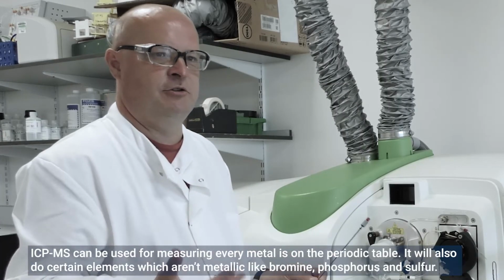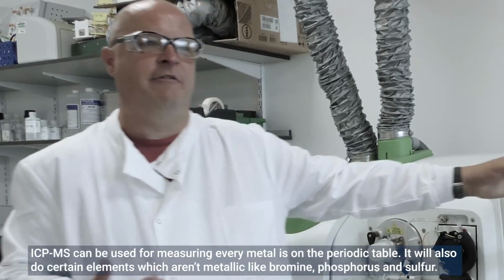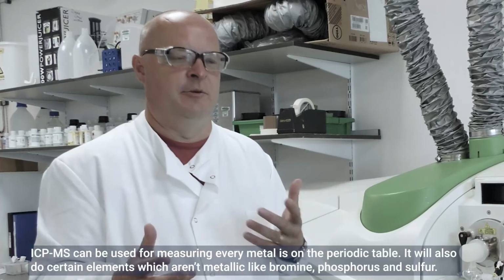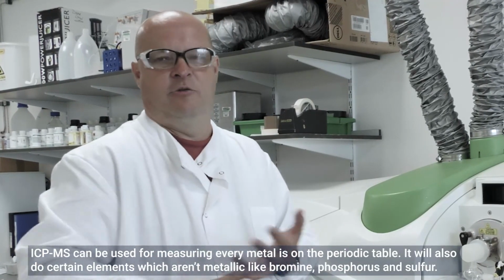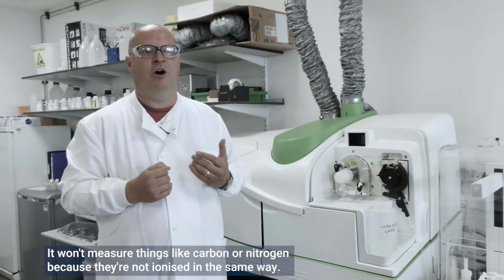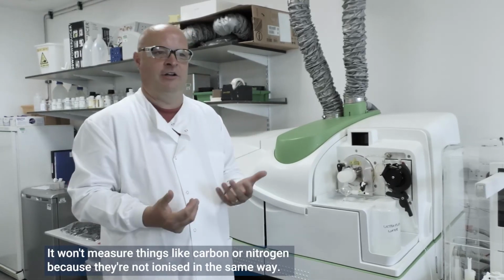ICP-MS can be used for measuring every metal that's on the periodic table. It will also do certain elements which aren't metallic, like bromine. It will measure phosphorus, it will measure sulfur. It won't measure things like carbon, it can't measure things like nitrogen because they're not ionised in the same way.